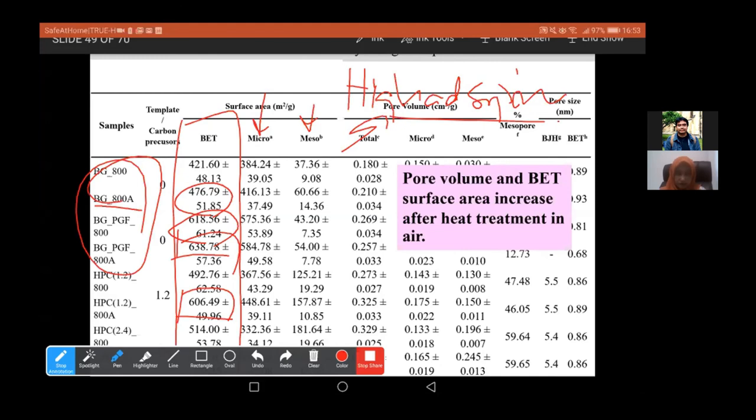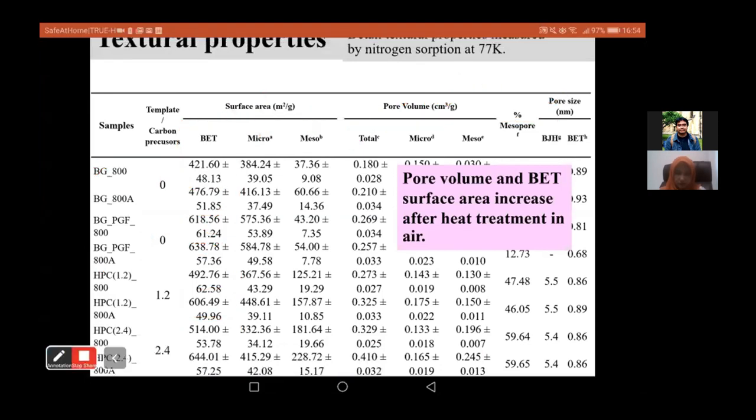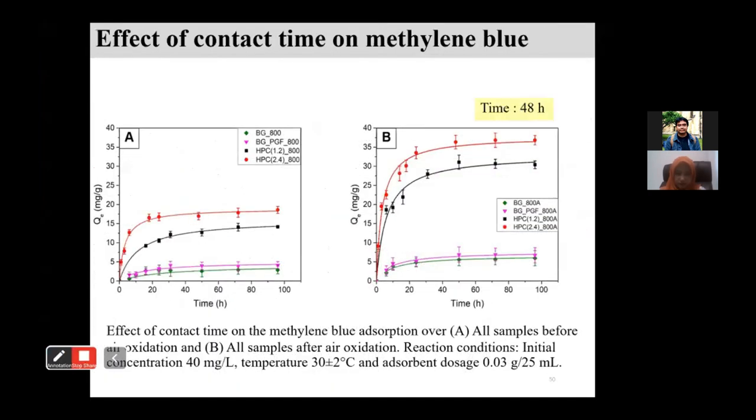Now, it's quite strange to me what happened in that case. So we drew the scheme. We also made the first experiment for the kinetics and, of course, for the equilibrium. And we found that the kinetics is not really fast. It's about 2 days, I would say. But this is really normal for monoliths, for big adsorbent particles. If you have powders, it would be quite fast, right?